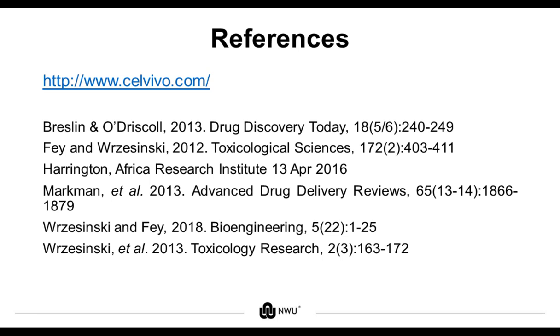All right, and it looks like we have time for one more question. Can you take your spheroid out of the well for metabolic profiling study? The spheroids are in a bioreactor, so they are not in a well. They are prepared in the well, but after an incubation period, you transfer them into your bioreactors. From the bioreactor, you do your daily sampling. I don't know why you would want to sample from the well.